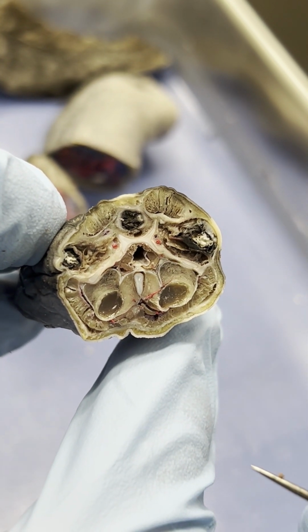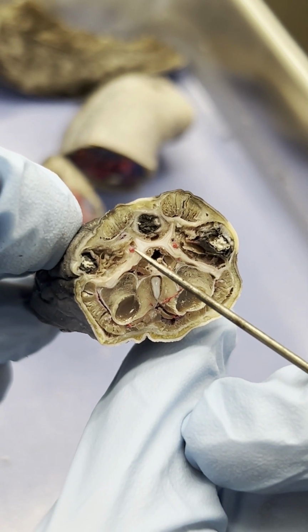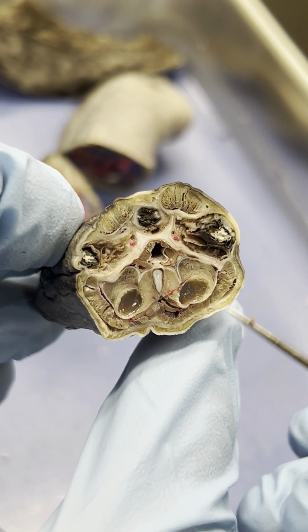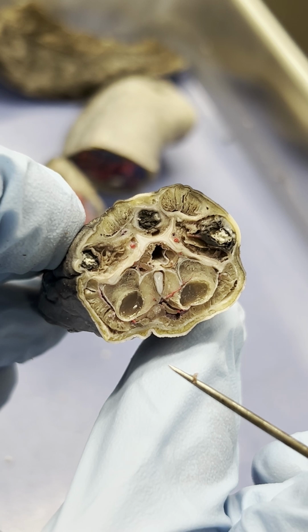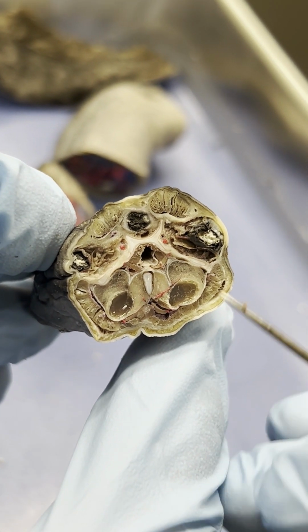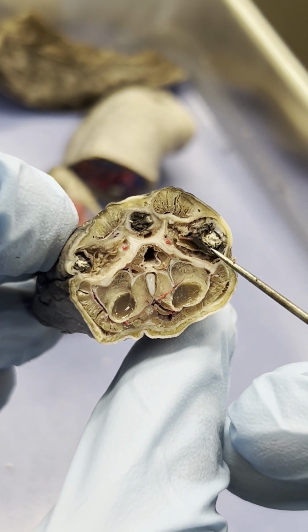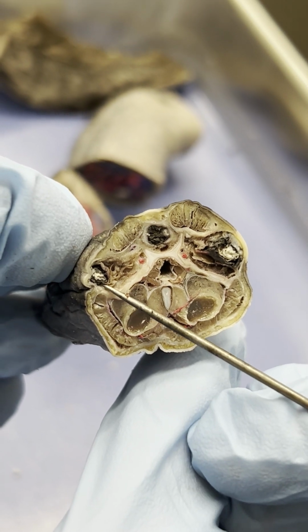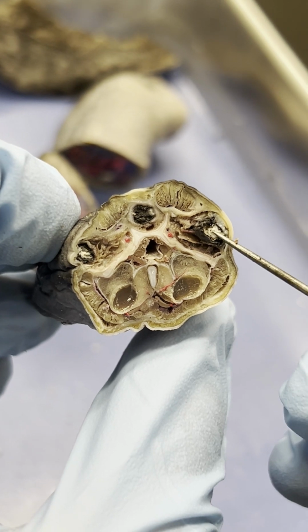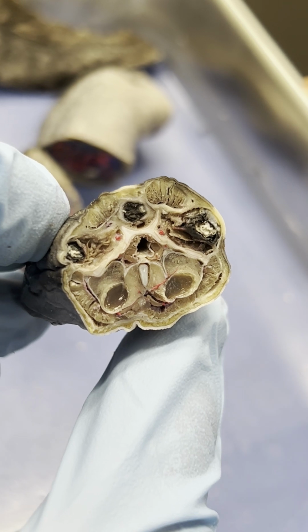Then we have carotid arteries, which are nicely and beautifully dyed. I think Dr. Mick and I are spoiled with this specimen so far with the veins and the arteries. Our next structure is the lens of the eye. So the lens of the eye is here. This black area right here is the actual eye. The black is the actual eye, but the lens of the eye is the white material in the center of this black, which again is the eye.